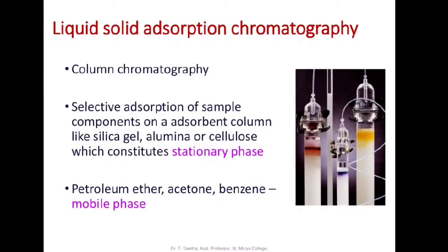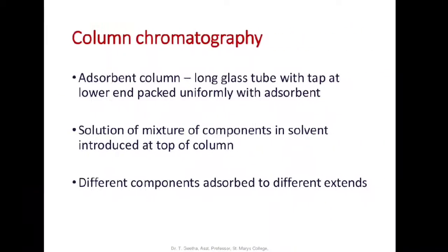The stationary phase is a finely divided adsorbent like silica, alumina, calcium carbonate, cellulose, etc. The mobile phase may be a solvent like petroleum ether, acetone, benzene, water, methanol, etc. Sometimes mixtures may also be used.